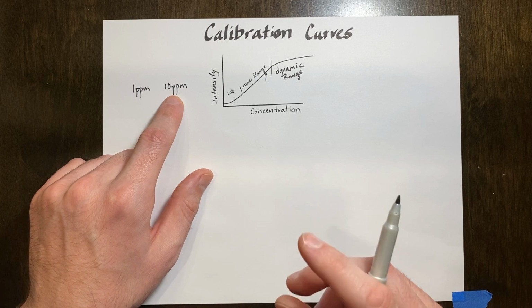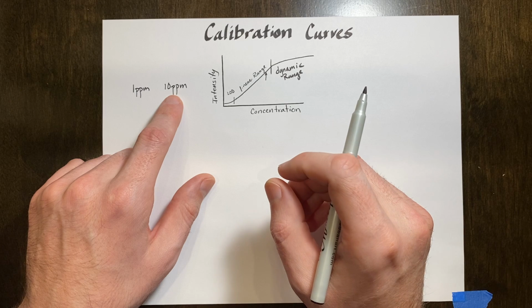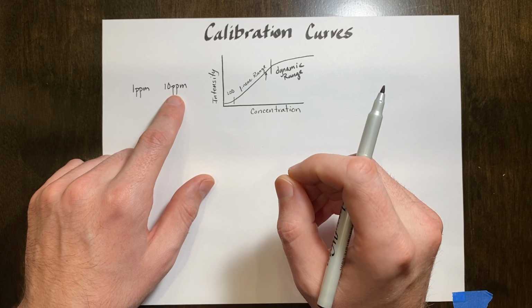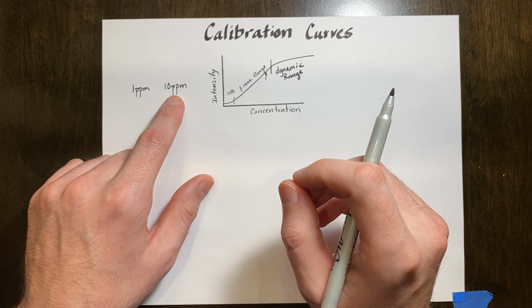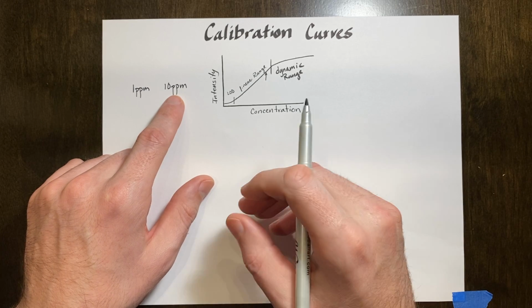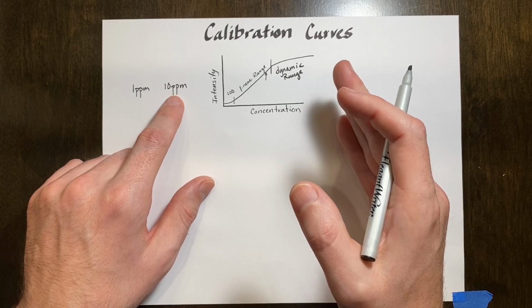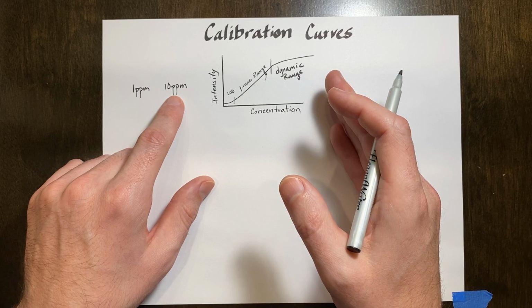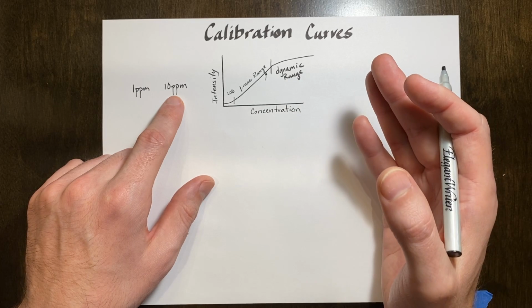But that would be inadvisable. For one, it's difficult to measure that low of a quantity accurately. In general, I would say don't measure less than 50 milligrams on an analytical balance and expect it to be very accurate.